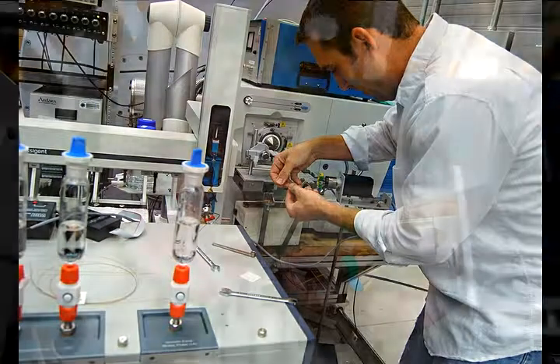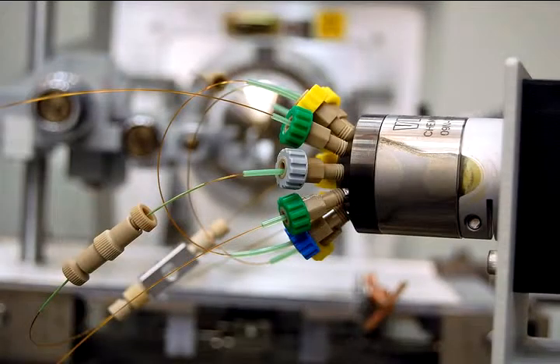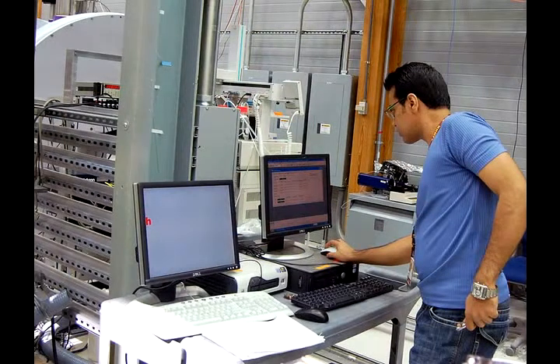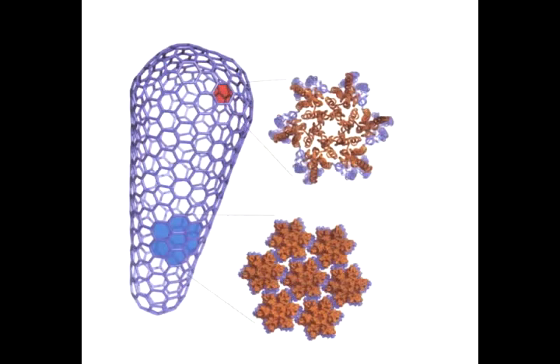Another application is to look for drug targets. So to design a drug, you need to know where the drug will attach to prevent whatever it's supposed to stop working. And so we've used that to determine how the protein coat holds the AIDS virus inside, and therefore now people can have a target to break those connections, and then that should release the virus and kill it.